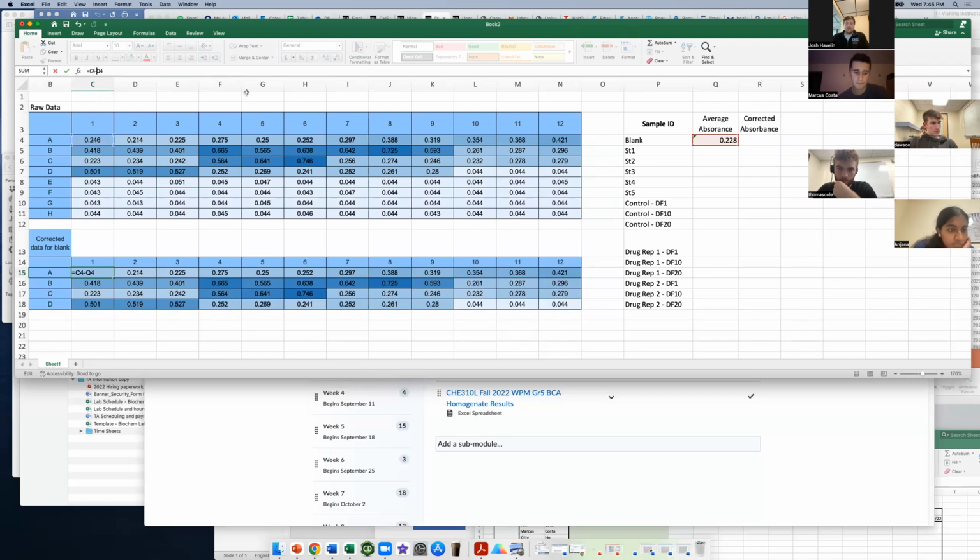Okay. And then if we put these dollar signs up here, what I've told Excel now is that I want this cell to equal whatever cell is 9, 11 cells above it minus this cell only, right? So I've locked this cell ID, but this cell ID is going to follow wherever I move stuff.